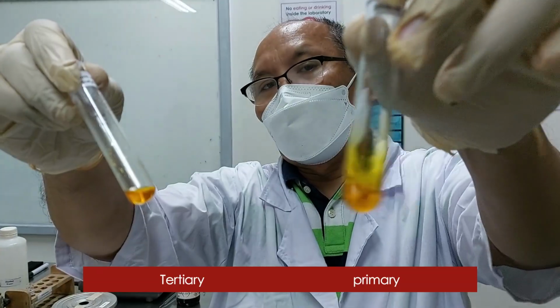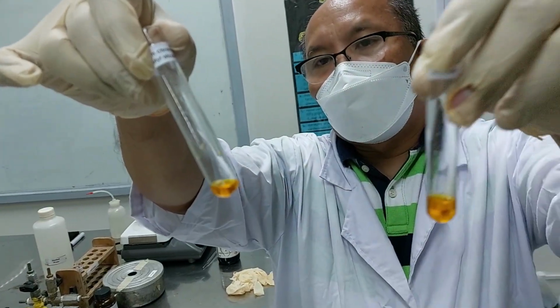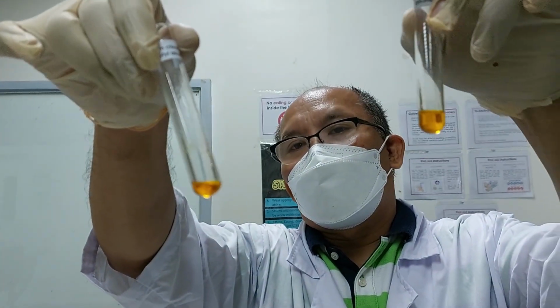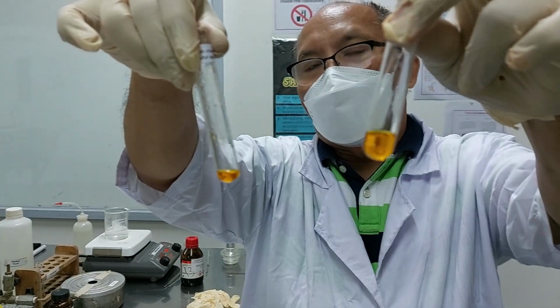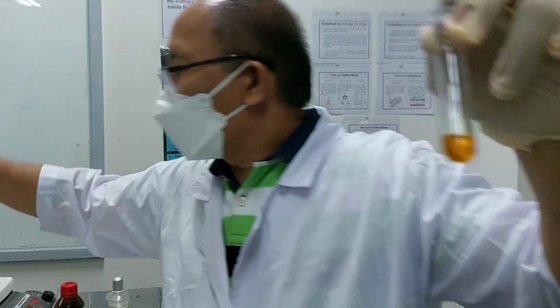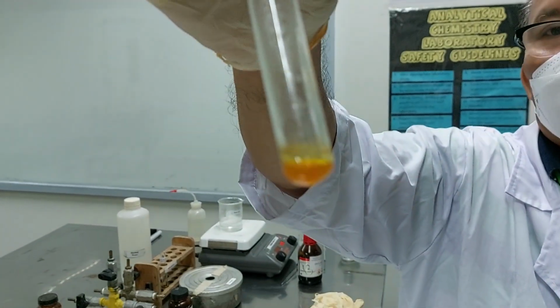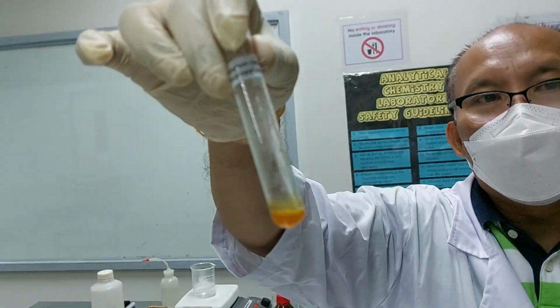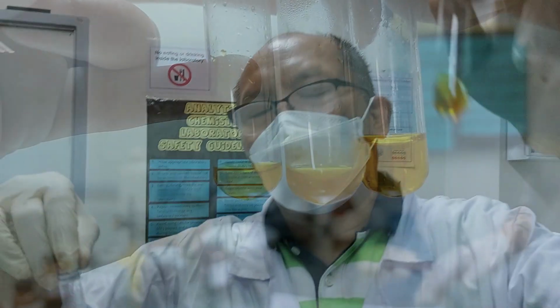You see the color, and this one, look at that. The orange color in tertiary is very prominent compared to ethyl alcohol. Now, if you compare isopropyl alcohol, it's very obvious, no? It's cloudy already. So that means it is oxidized to ketone. For secondary, ketone; for primary, carboxylic acid.